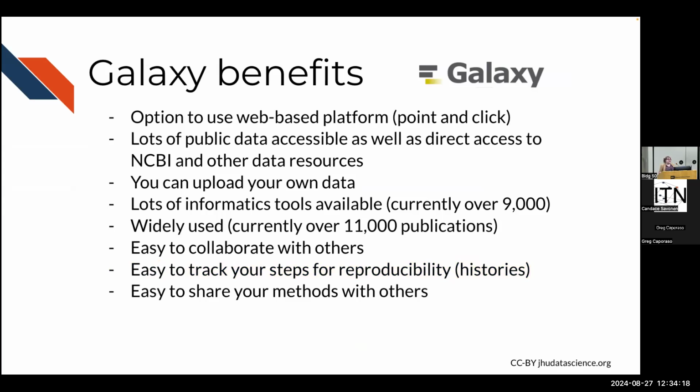And let's say that someone is telling you about some analysis they want to do, or you need to test out a tool and you don't really want to have to bother with installing that tool locally, and you just want to see if that tool will work with your data. This is another big benefit of Galaxy, that you can test out that tool. You can see if it will do what you need with your data before you even try to install it locally. So Galaxy has a lot of benefits for you to try out things, for you to have reproducible research, for you to have access to tools that are going to work because they're supported.